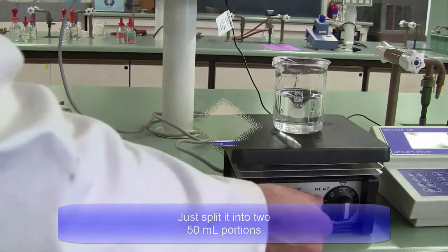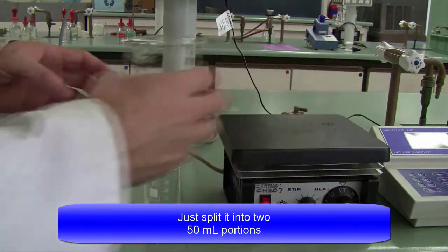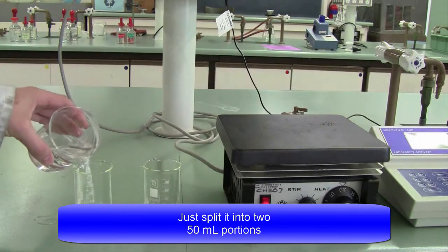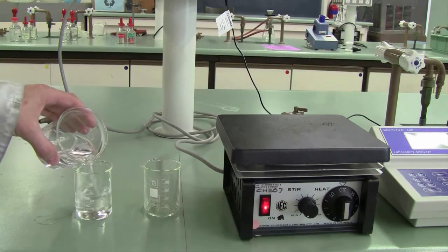Once you've measured the pH of that solution, I then want you to split it into three even 50 ml portions. It doesn't have to be extremely accurate, you can just pour by eye into beakers.